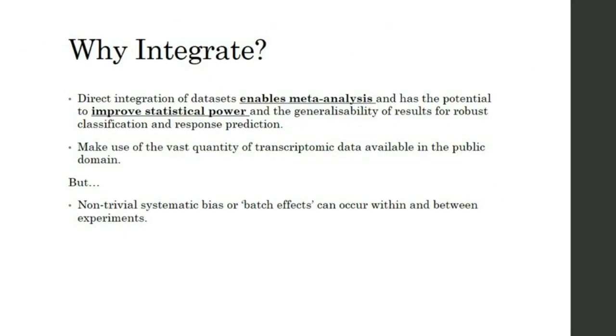So the question is, why would we want to integrate? As I said before, this really allows us to perform a meta-analysis and clearly allows us the possibility to improve our statistical power and the generalizability of results, to make more robust classifications and response predictions. One other advantage is we can start to make use of the vast quantity of publicly available microarray and transcriptomic data which is out there in the public domain.